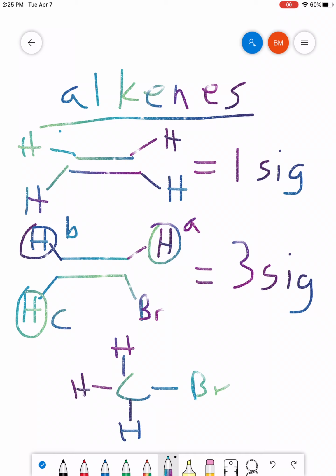All right, in this case, obviously, these 3 H's are exactly the same. The reason for this is that, remember, whenever you have single bonds in an organic molecule, you get constant rotation around those single bonds. They spin much like the blades of a helicopter on the rotor. If a helicopter is at rest, you can see maybe 3 individual blades sitting there. But once it's running and they're all spinning around, it goes so fast that you can't really distinguish them. You just see one big blur, and that's what the NMR sees here.